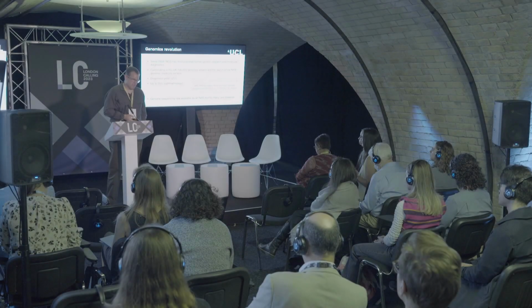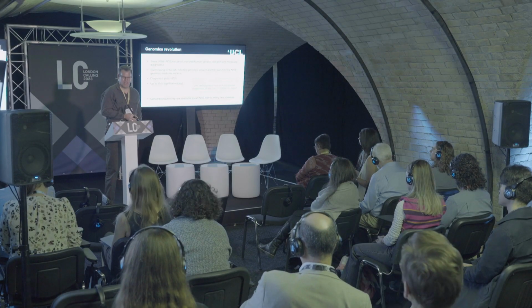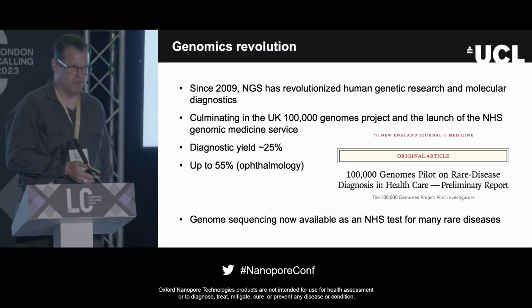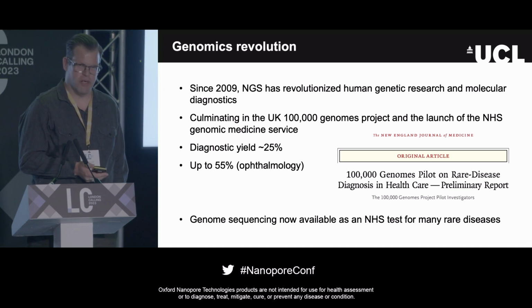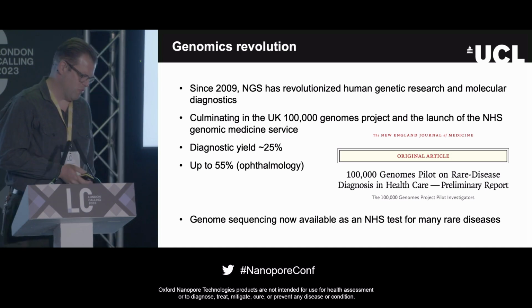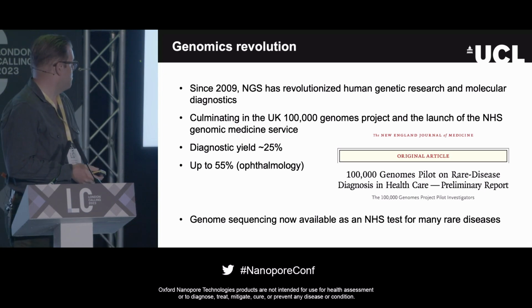I'm going to talk about how we are using Nanopore sequencing in my lab to answer some questions in the research environment, some clinically relevant questions that we come across at Moorfields Eye Hospital. So a little bit of background.